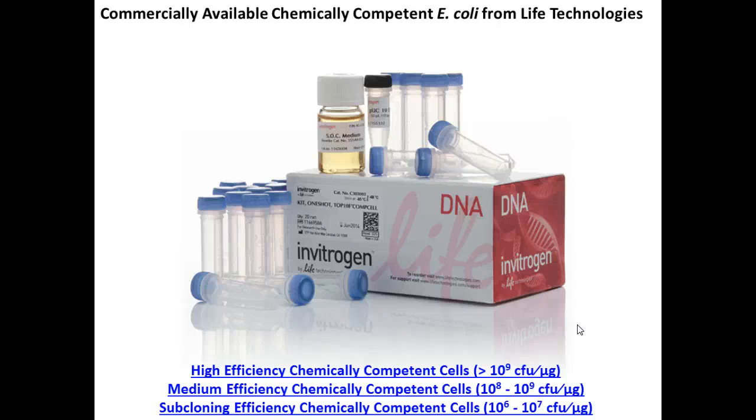And commonly this is done when they're trying to do, what's the word? Actually, I think sometimes the original clone may have multiple genes. Yeah, and from there they whittle it down to the one gene they're looking for. But also they'll use it when they're trying to make mutations sometimes. You want to replace just one amino acid. Or if you want to know all the genetic information, they'll do, no, sequencing. I don't know why that would not come to my head. So if you have an organism, they just chop up the DNA, take pieces of it and put it into different subclones, and then they send it off to be sequenced by a lab.